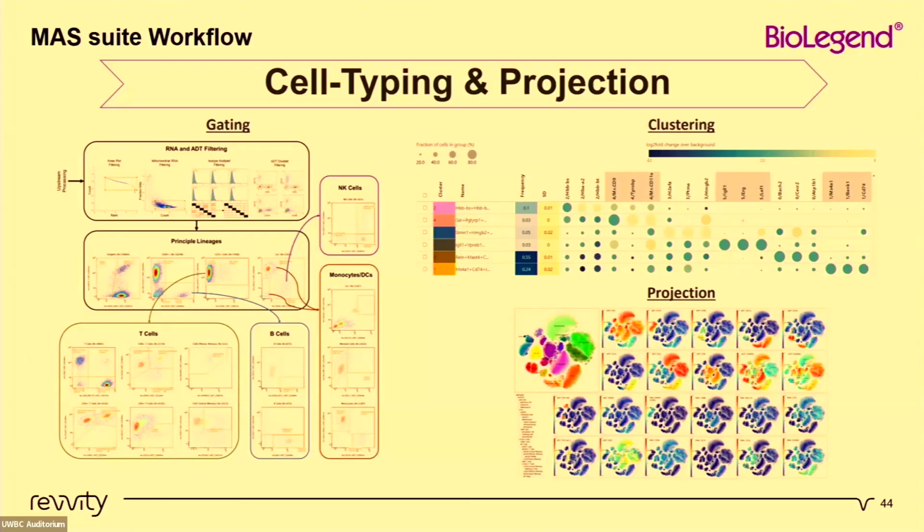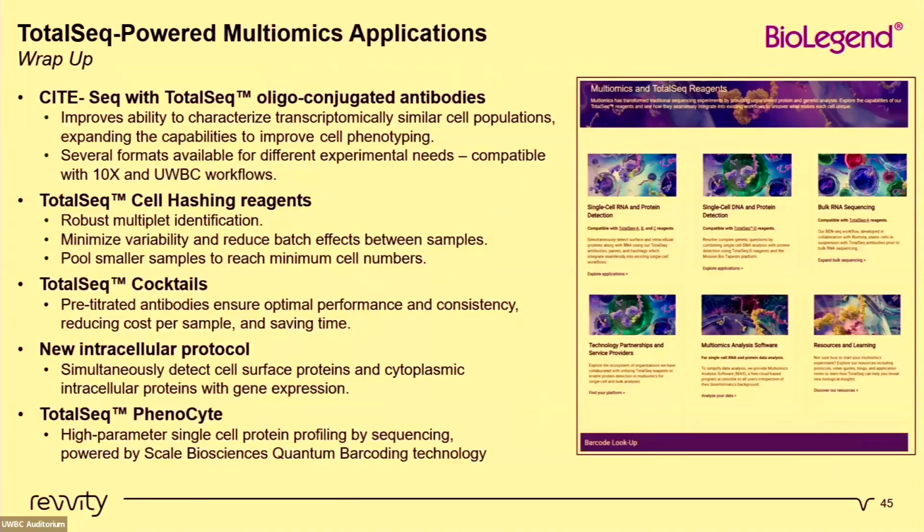And then you can colorize these projections based on cell markers. So I think here they're super tiny, but I think that these are looking at either T cell, B cell markers, CD4, CD8, whatever they may happen to be. I just can't read any of them. They're way too small and too blurry. But those would correlate, and you can map out what those different cell type clusters would be. So you can determine where those different proteins are expressed.